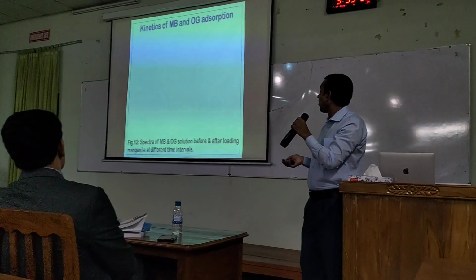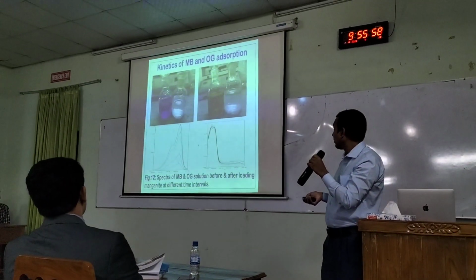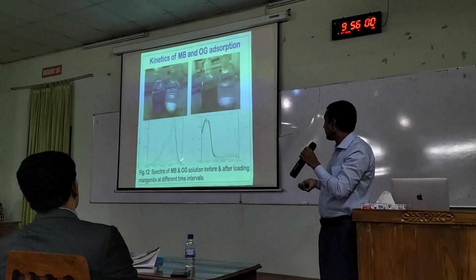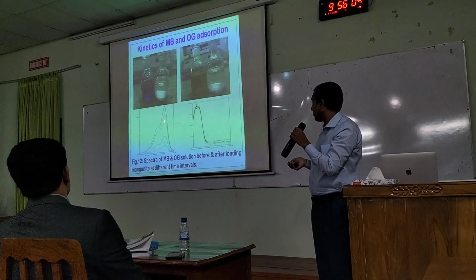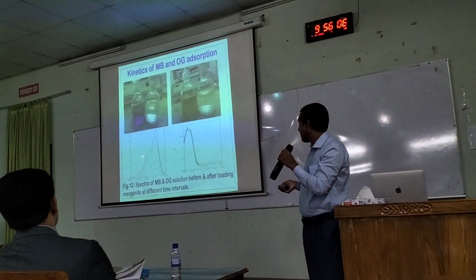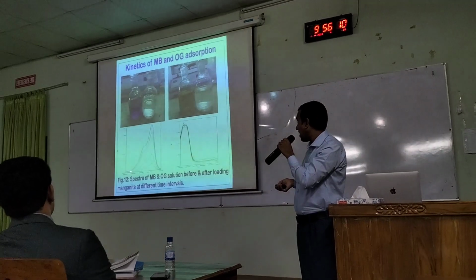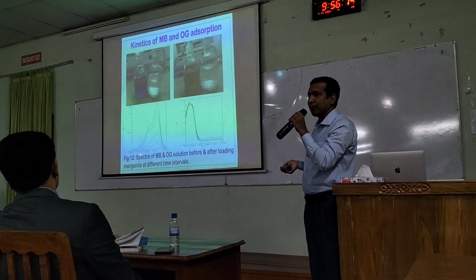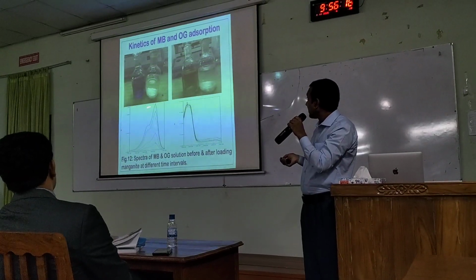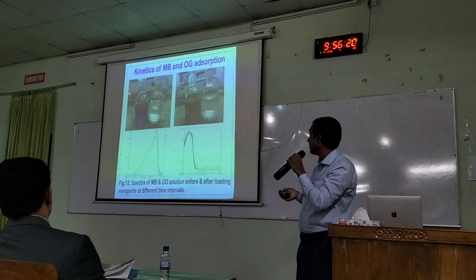I have also determined the molar extinction coefficient. Then kinetics of methylene blue adsorption. So we see the spectra of the decrease of dye concentration with time, and it is interesting to see that the absorbance decreases with increasing contact time. And here are the pictures of before and after adsorption for these two dyes.